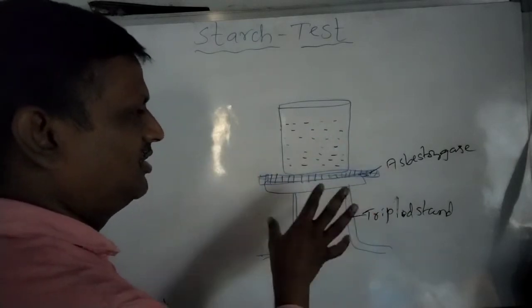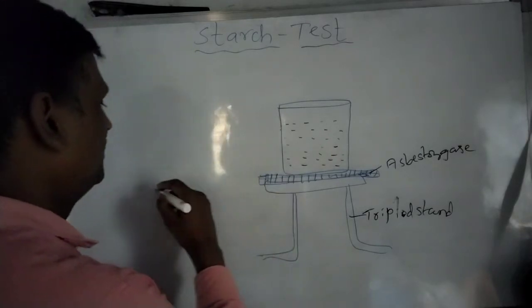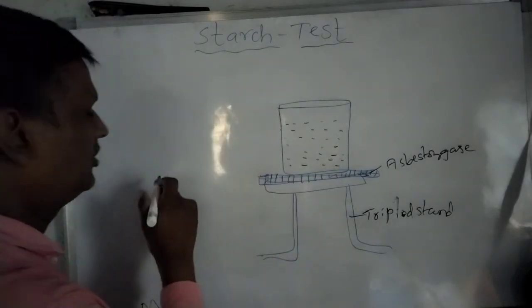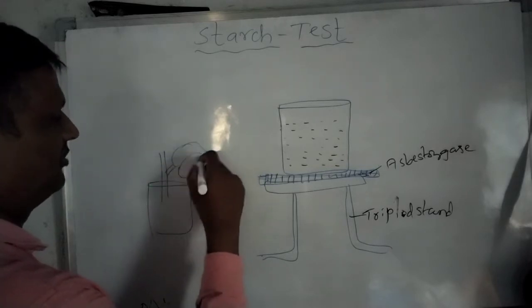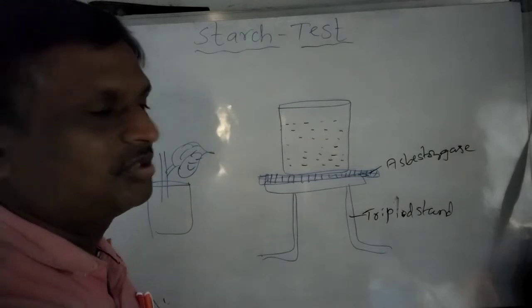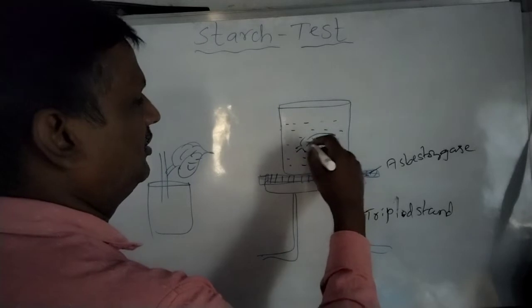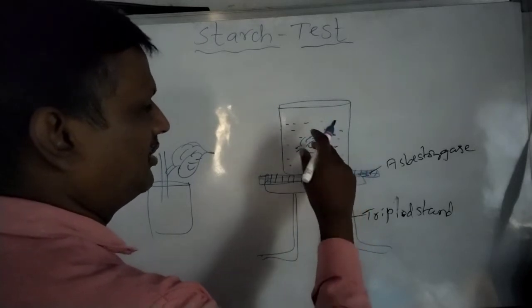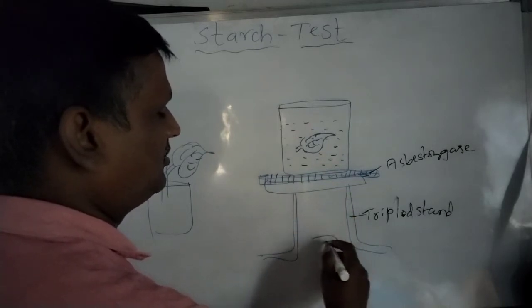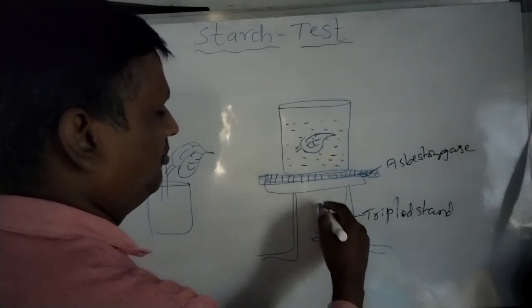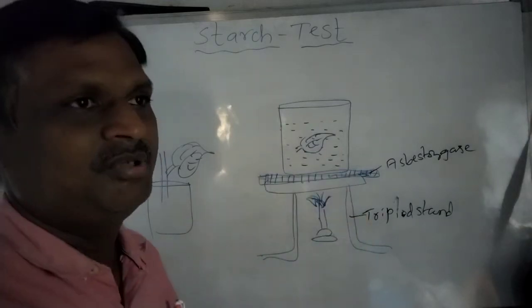Next, select a healthy leaf from a potted plant. The healthy leaf should be placed into the beaker of water and heated with the help of a Bunsen burner for some time — the leaf should be boiled or heated for some time.